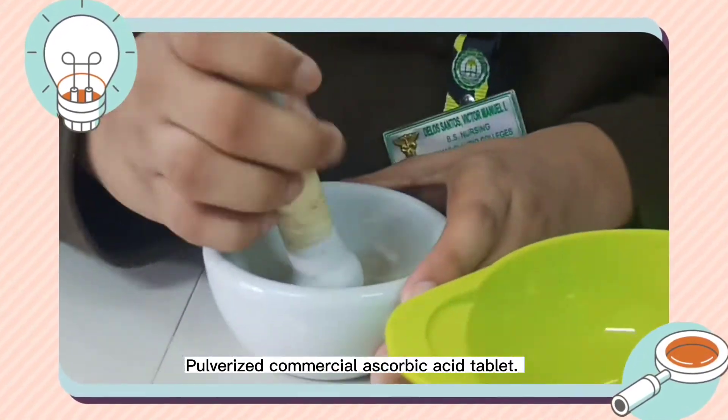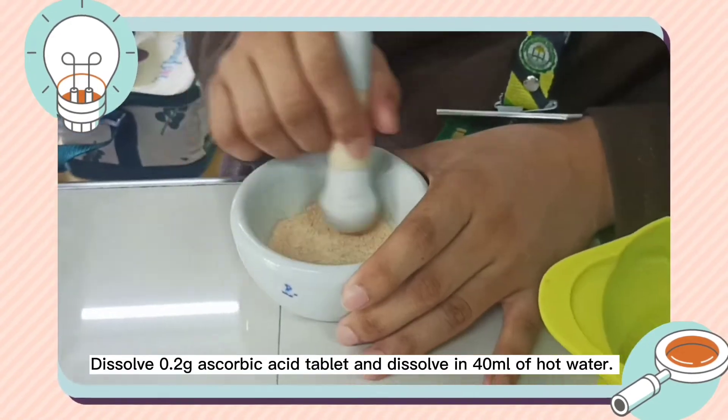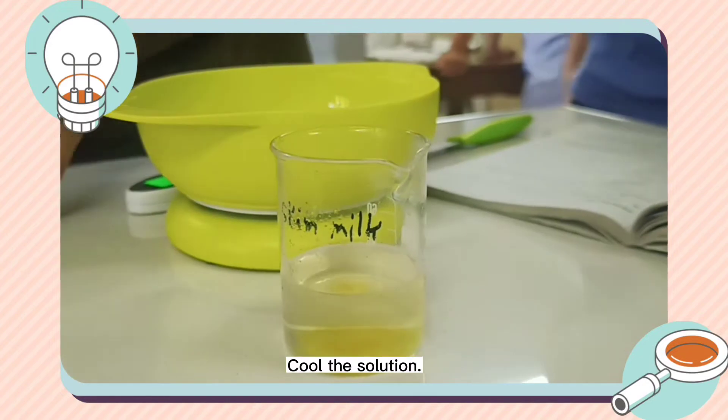Pulverized commercial ascorbic acid tablet. Dissolve 0.2 gram ascorbic acid tablet in 40 milliliters of hot water, then cool the solution.